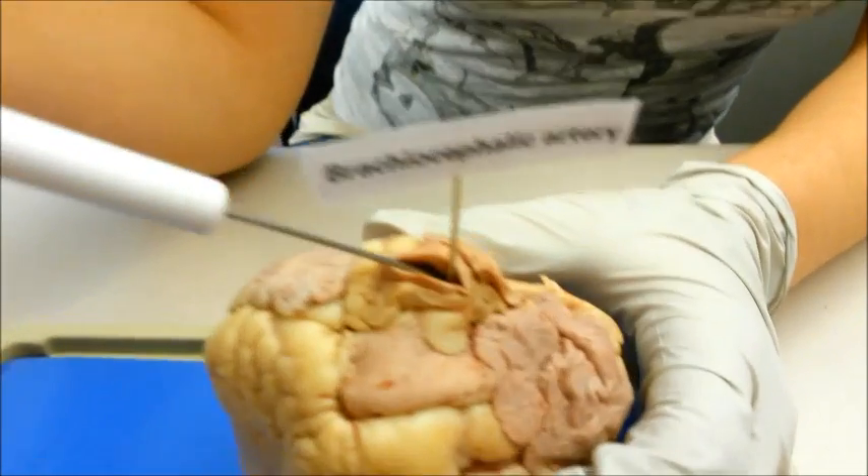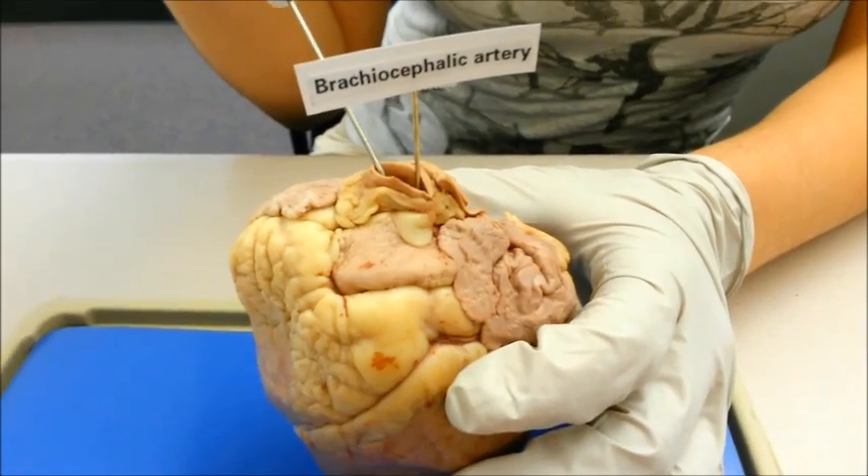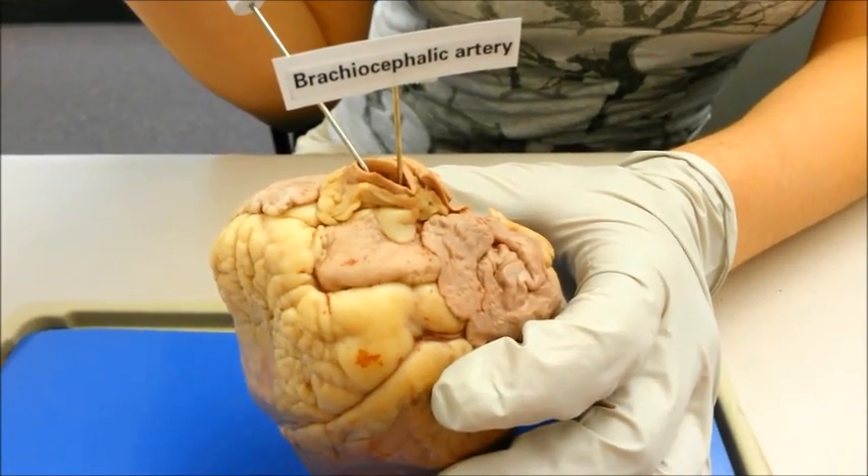The brachiocephalic artery is one of the three arteries that branch off of the aorta. It supplies blood to the head, neck, and specifically the right arm.